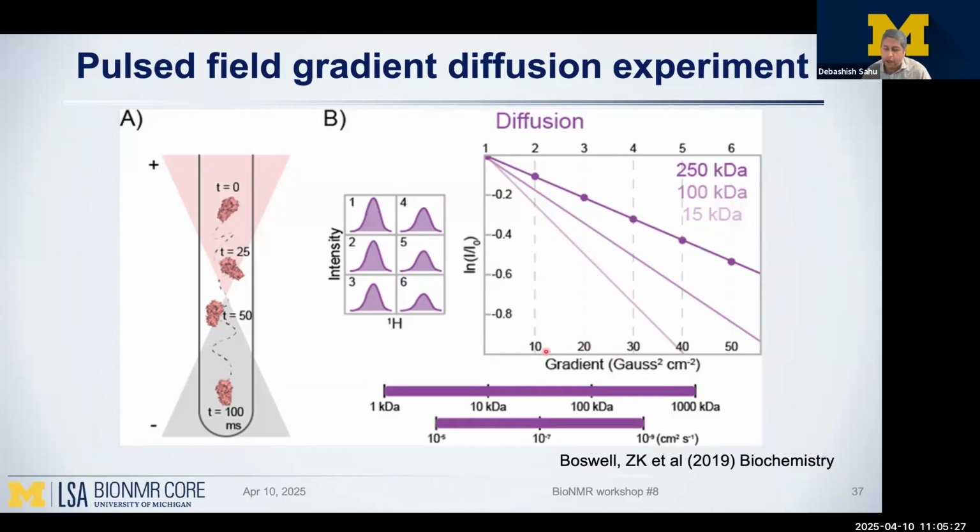Again, if all protons are labeled, you're going to have a lot of issues. So here you just label the methyls, and you can use that as a probe to do your pulsed field gradient experiments. Millie has helped a lot of people run this for small molecules, but if you have these labels as methyls, you can use that as a probe to do your PFG experiments for looking at large molecules. Are they tumbling as a monomer, dimer, homodimer, all that kind of stuff?